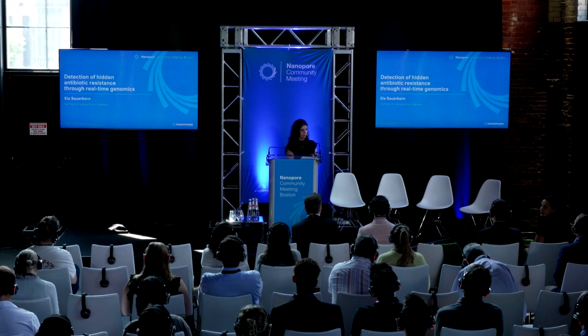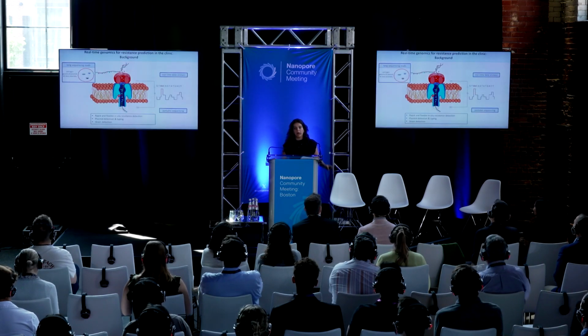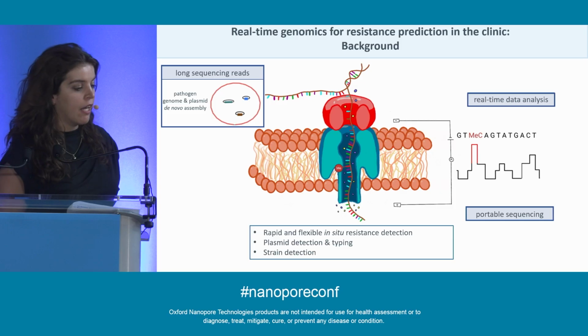I'm going to talk today about a specific case that we've recently published of a complex Klebsiella pneumoniae infection, where we showed that real-time genomics, particularly nanopore sequencing, could help uncover hidden antibiotic resistance. So I don't have to tell anyone about the benefits of nanopore sequencing, especially in the clinical microbiology context.